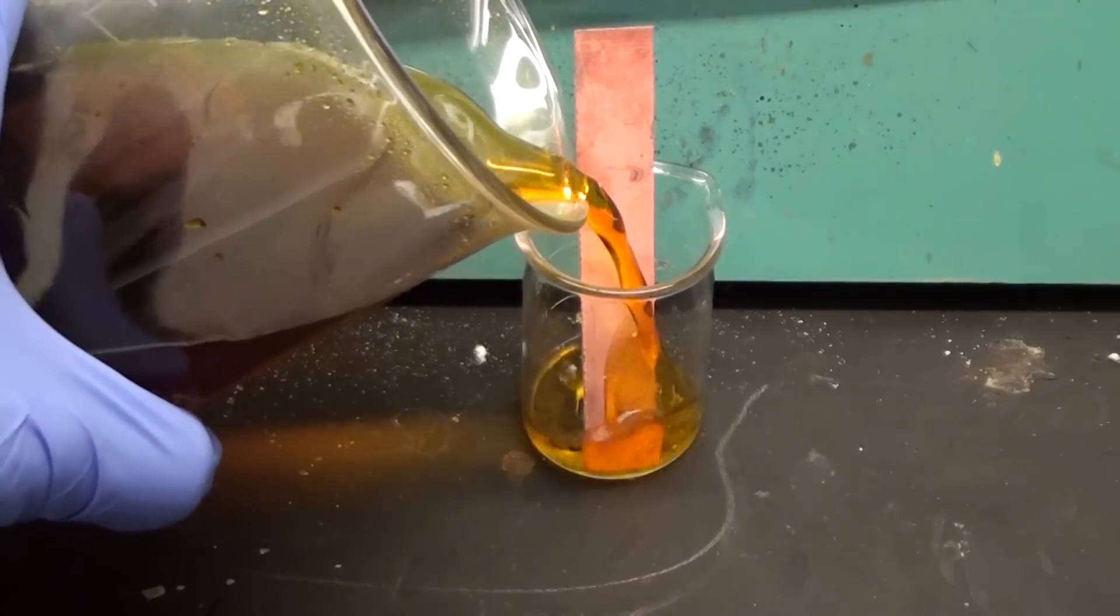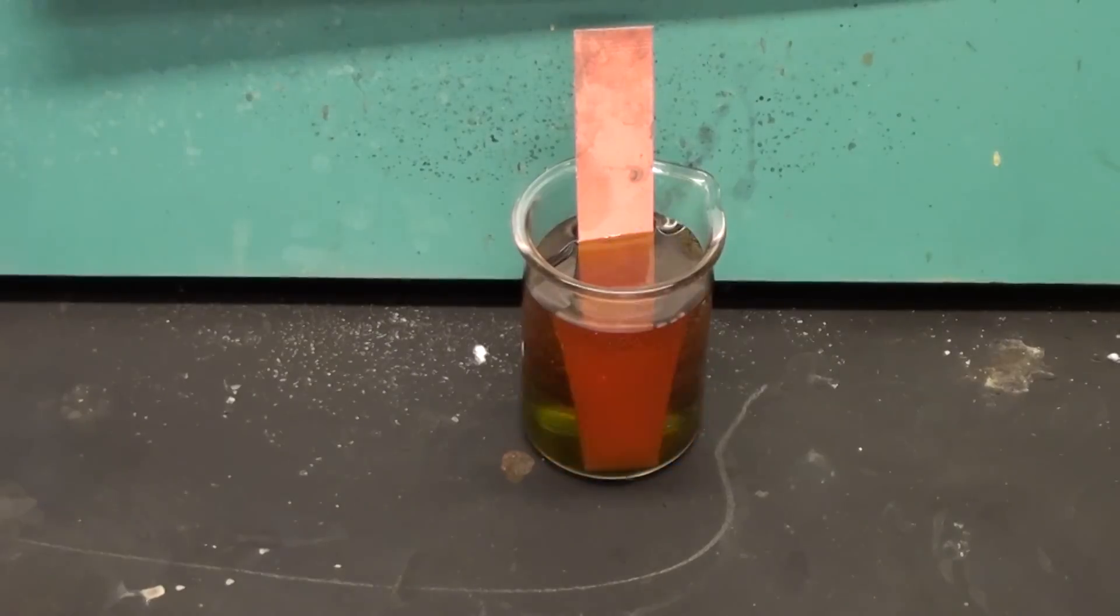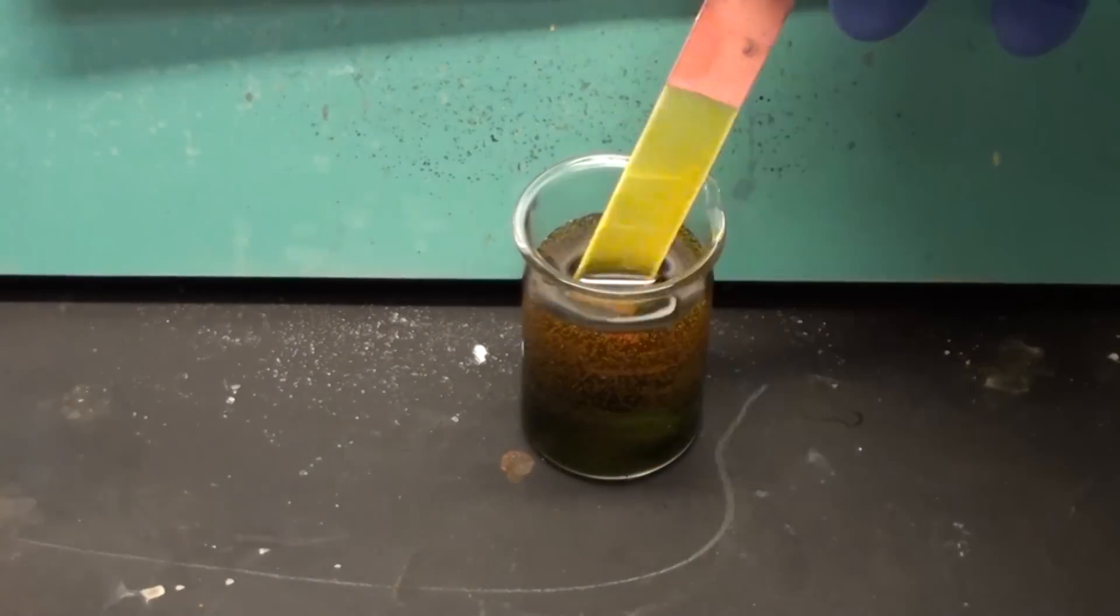To test it we'll just stick in a small strip of bare copper clad board. After a few minutes we have etched off the copper.